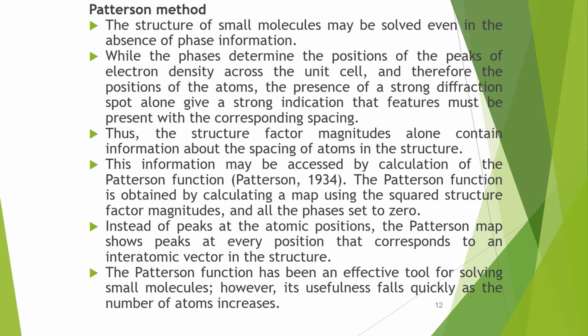There is now the Patterson method. Now we will discuss this Patterson method in this slide. The structure of a small molecule may be solved even in the absence of phase information.